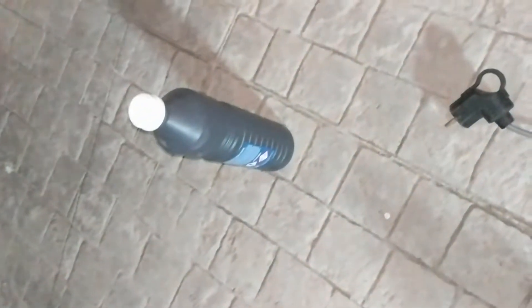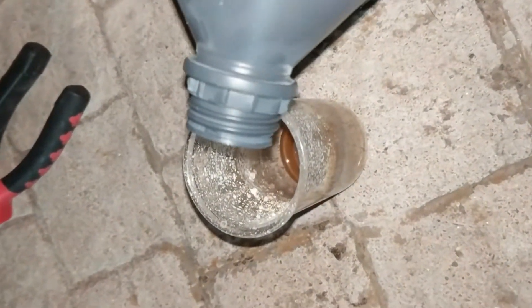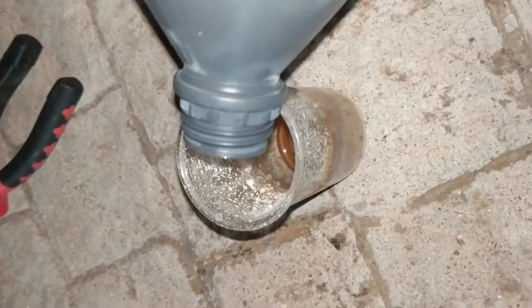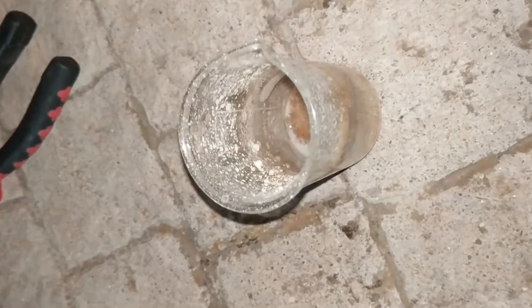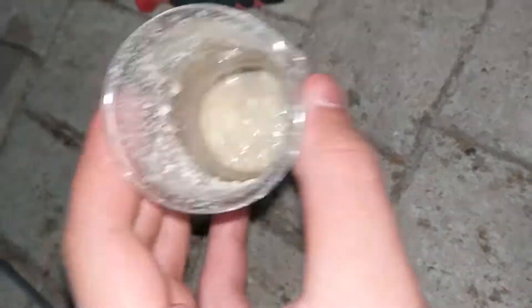What I'm going to do is the traditional fix — adding more nitric acid. Here I am just adding in a small splash of acid. I've got some nice silver nitrate precipitating out.